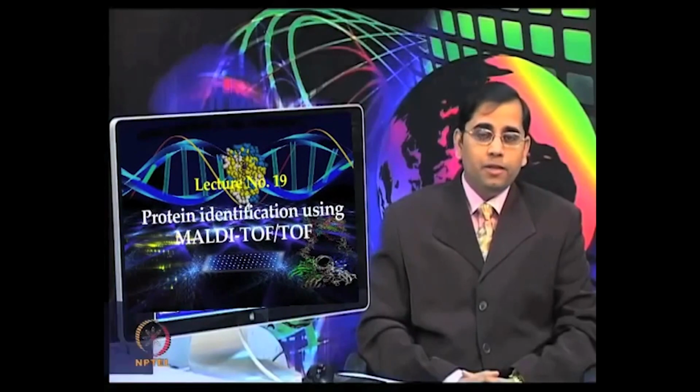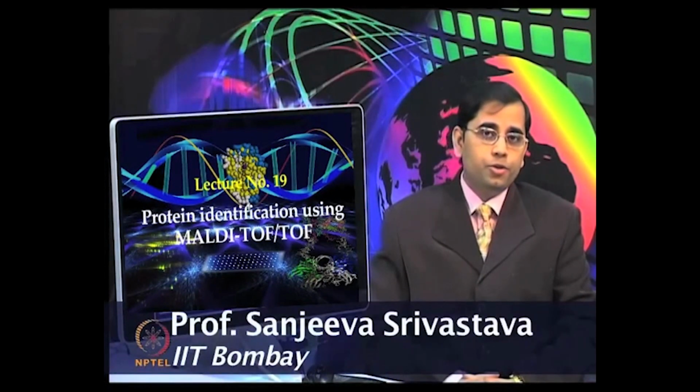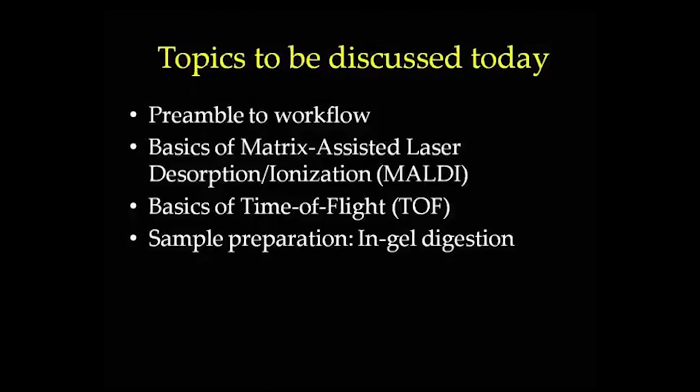So, let us switch gears from the previous module on gel based proteomics and now switch on to mass spectrometry and its various type of applications. I will describe the role of MS and various basic concepts involved in understanding the mass spectrometry.